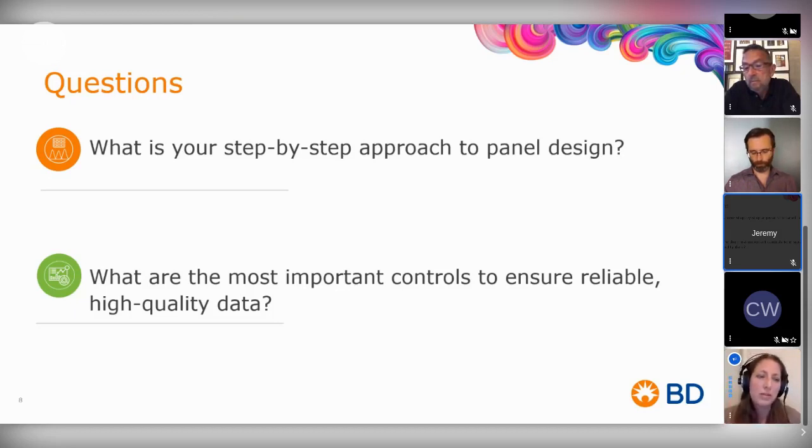Basically, the FMO allows you to determine whether there's a lot of background noise due to spillover spreading from other reagents that are in there. But as a cautionary note, you should not rely on it for setting gates, because the threshold of where your gate to discriminate between positives and negatives should be set.